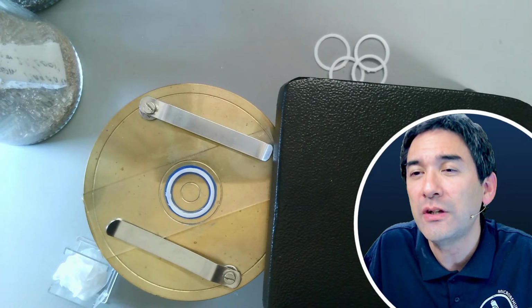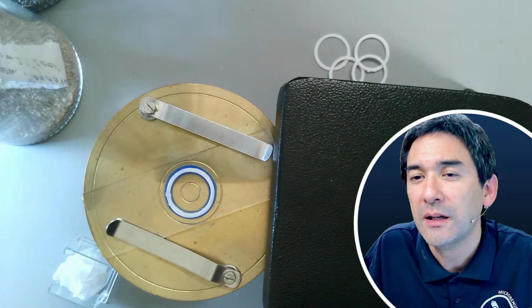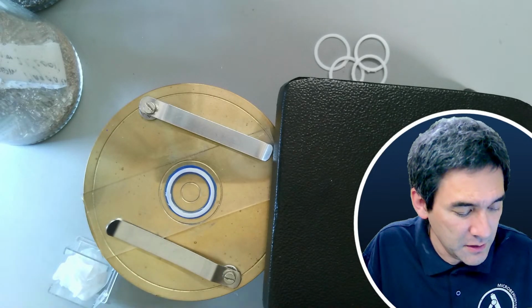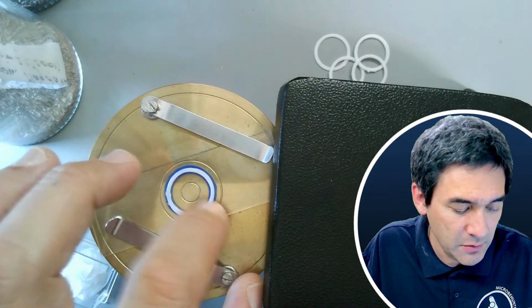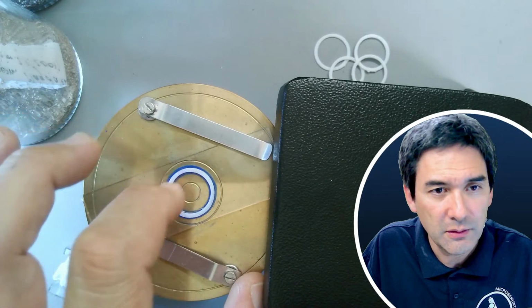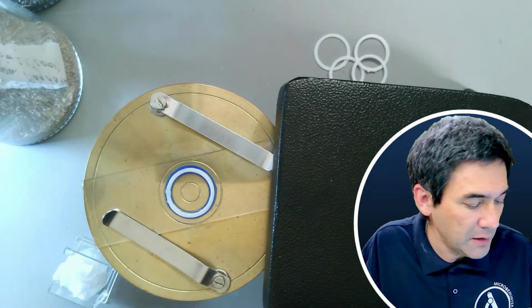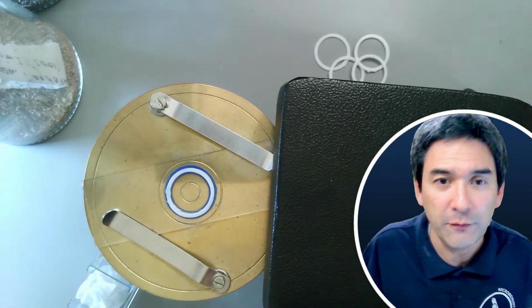Somebody's actually answering this here. Okay, about the working distance. So maybe this is fine now. I don't know. Let's push this a little bit. It seems to be quite solidly connected here. I think that's going to work. So I'm going to take out now a sand sample. I don't know which one. The one from the Kalahari is actually quite nice.